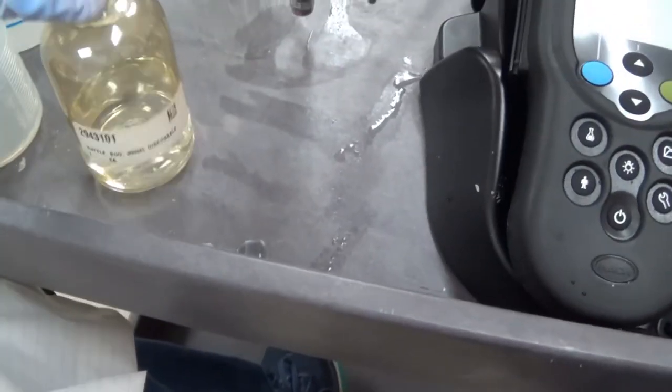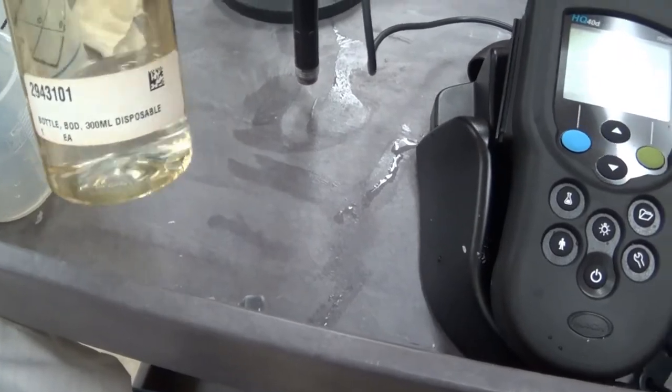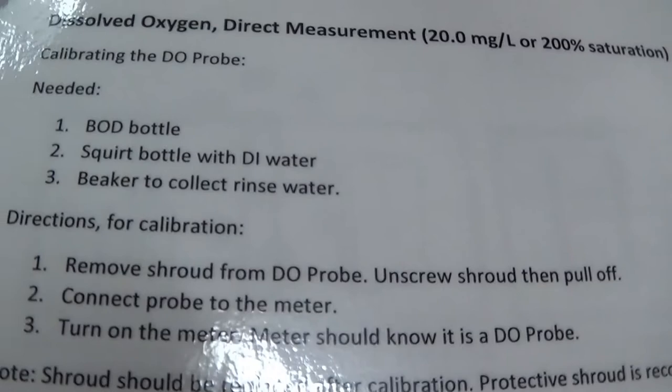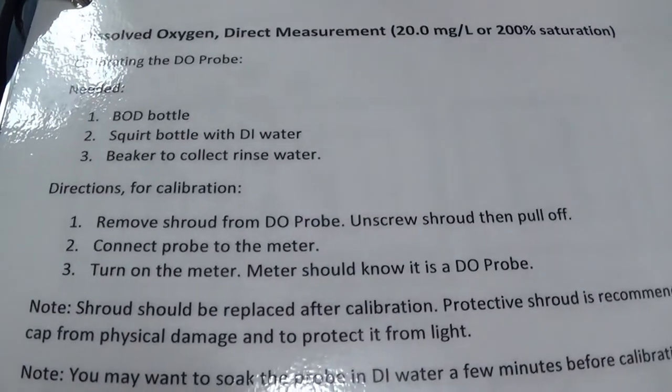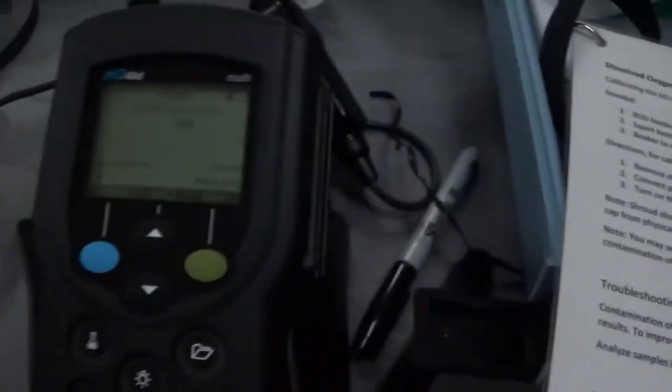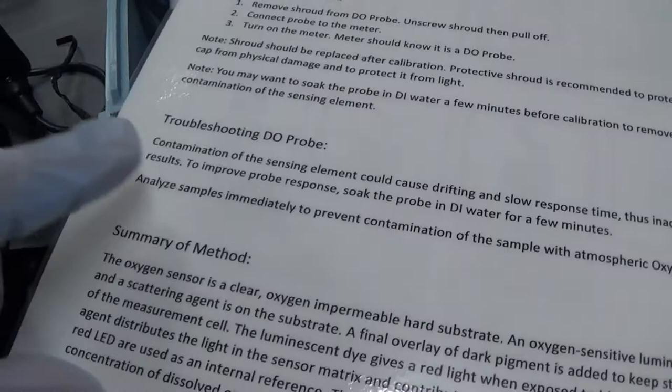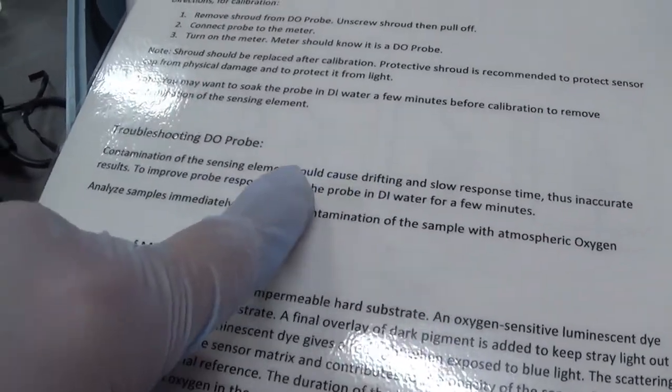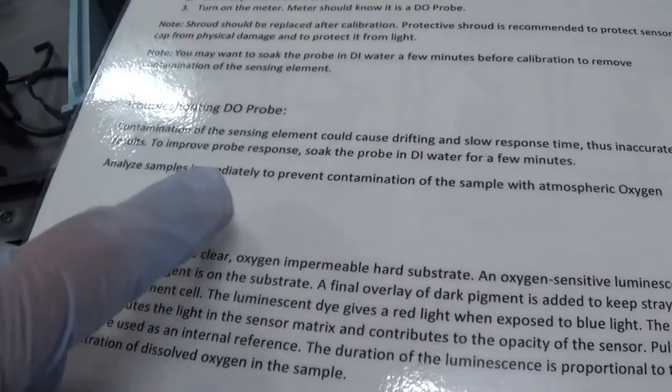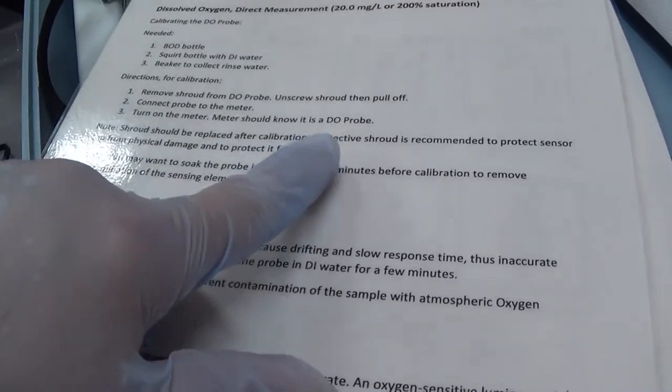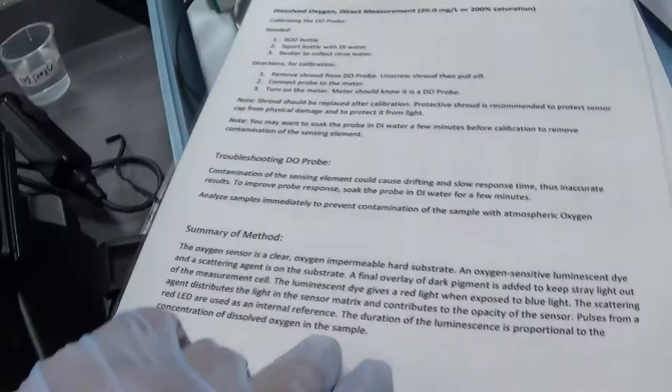We need a BOD bottle, which comes with our kit, and a cap that comes with our kit. This is what you need: your BOD bottle, the squirt bottle, beaker for rinse water. We may want to soak the probe to remove excess junk on it before use. It would cause drifting and slow response time. You should always have the protective probe cap when you are not using it, obviously.